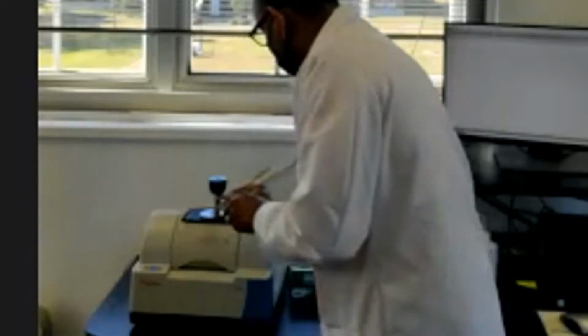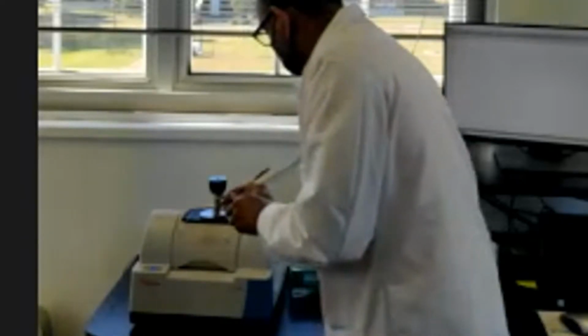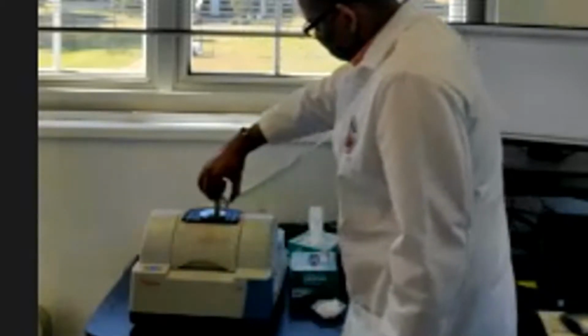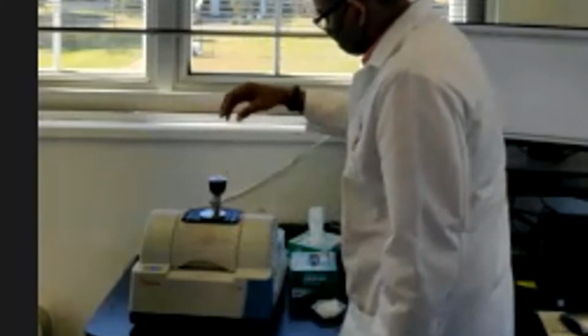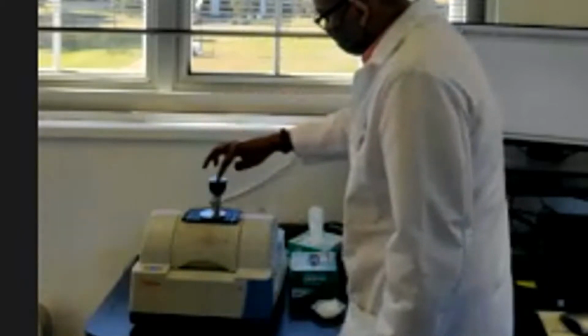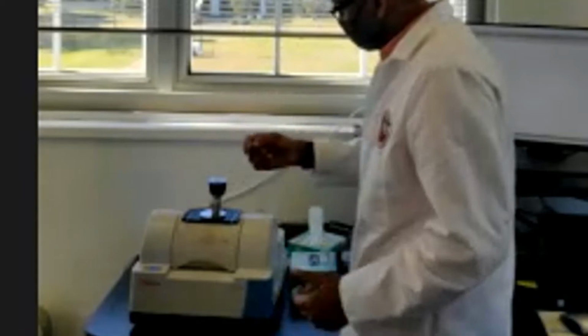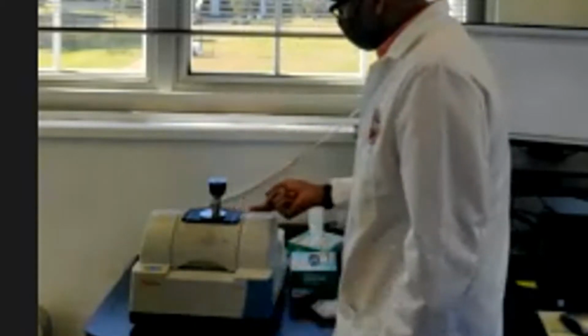Okay. Move it a little bit with the spatula. Center it into that diamond window. And then you push your arm of your press. That's a press. Then rotate it. It goes down until it presses that sample against the diamond window to make it flat, as flat as possible, because you need the sample. So the beam of the IR should pass through it, so it should be as flat as possible.